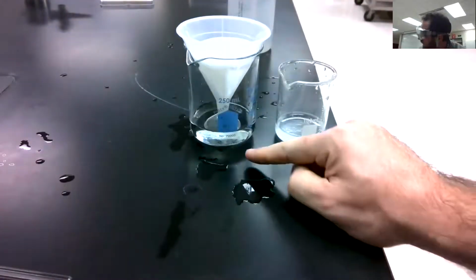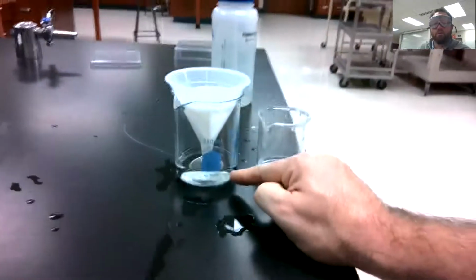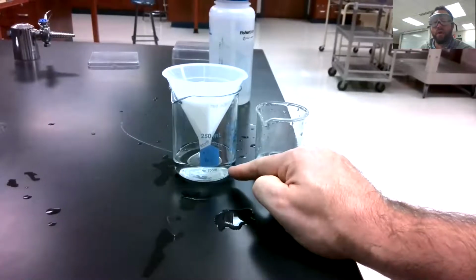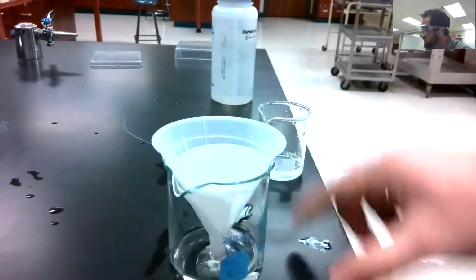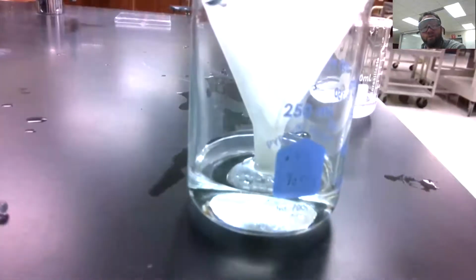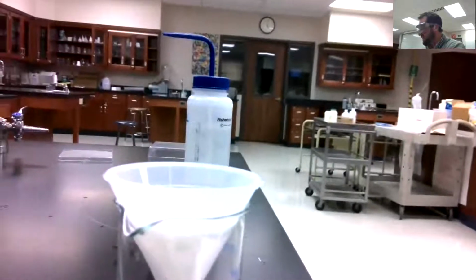So we're pretty sure we're making good progress because the water that we're pouring through the filter is clear. So we know we're not really losing any product there. Every once in a while, some busts through, and then this whole thing turns cloudy, and you're like, man, I ruined that. But it's still clear. Again, compare that with the solution we made, which we're still decanting. So we got a little bit left to go there.